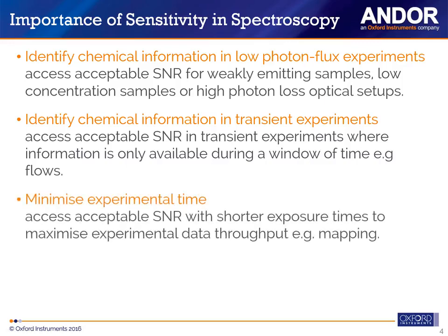Another reason could be, for example, to minimize the exposure time. So if you're dealing, for example, with chemical mapping, where you have to take a spectrum at a given position, for example, of a microscope stage XY, you need to minimize the exposure time per point, otherwise the experiment can be extremely lengthy. So any gain done at a particular point to get a good signal-to-noise ratio is extremely valuable time for this type of experiment.